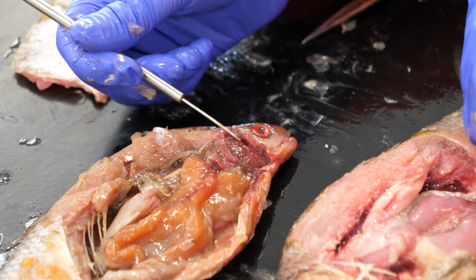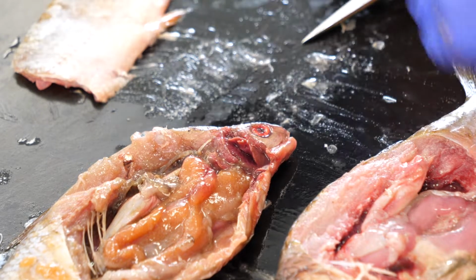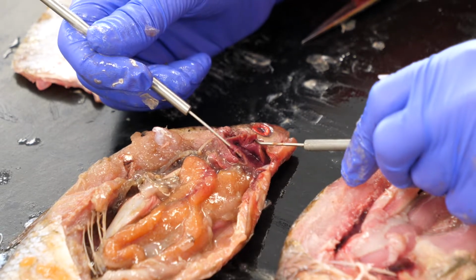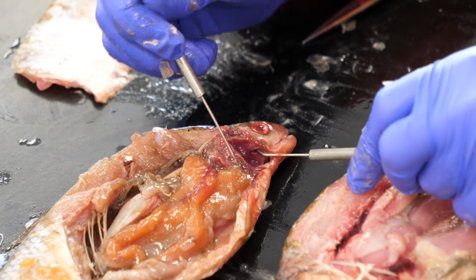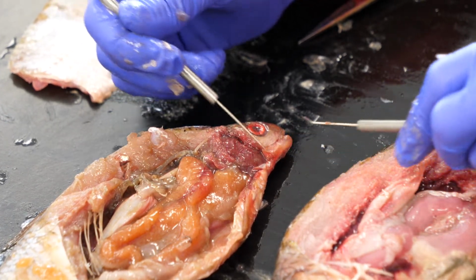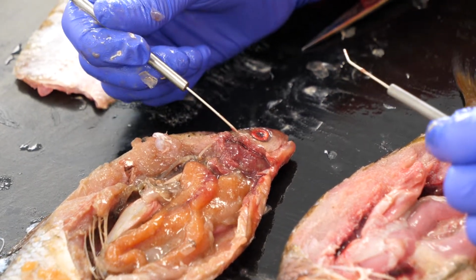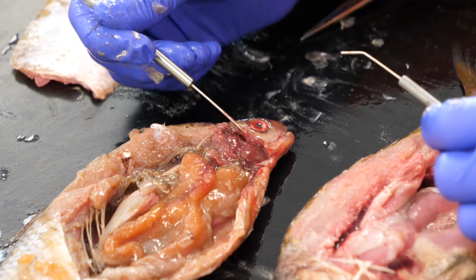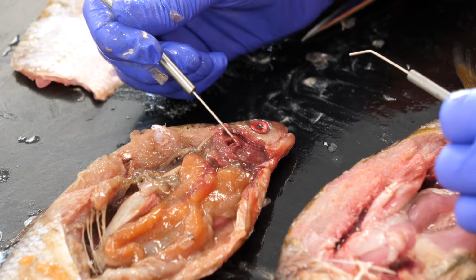So we've got the gill arch and we've got the filaments sticking out, each of these stacked one on top of the other. And if you remember, it is the bony fish that have the operculum covering the gill slits, but also the holocephali, the more ancient offshoot of the chondrichthyes.